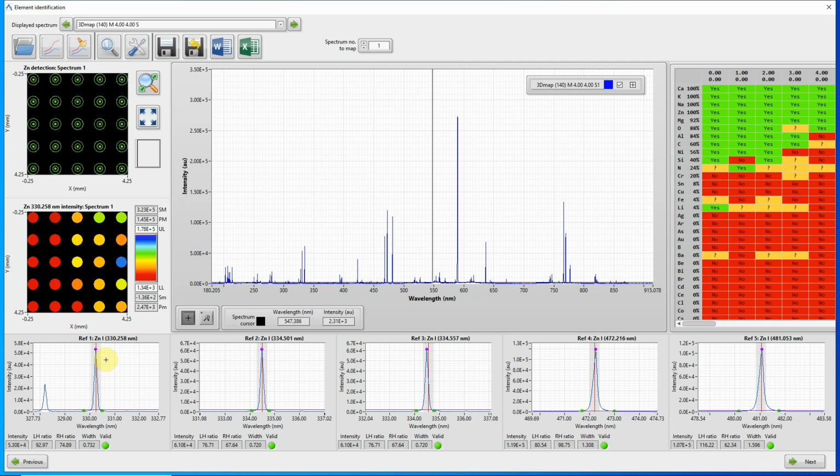Each of the 5 peak panels also includes various additional diagnostic data. For example, a horizontal purple line indicates the minimum peak intensity specified in the analysis configuration. You can see that line here. The intensity of the maximum and the signal to baseline ratio either side of the maximum are indicated at the bottom of each panel, together with the calculated peak width.